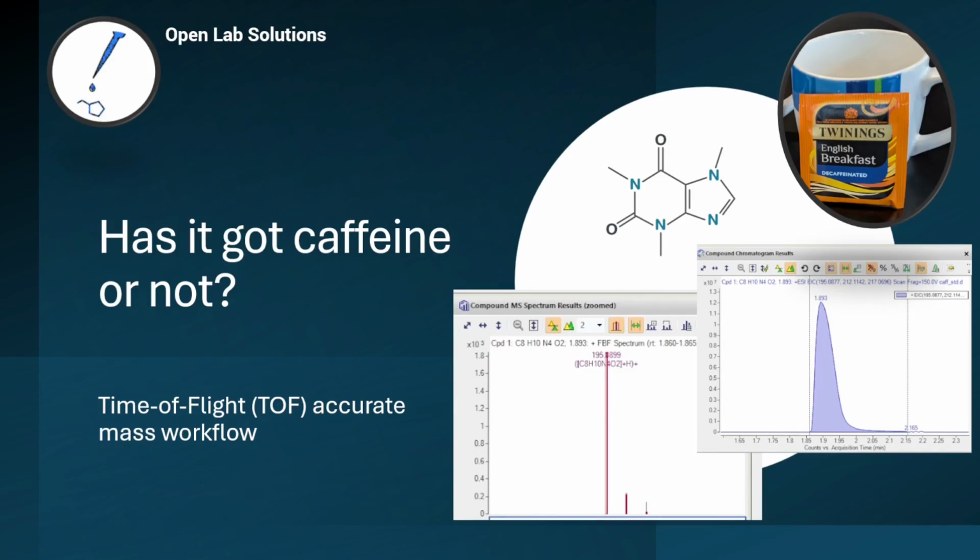Has it got caffeine or not? This is really to delve into some of those decaffeinated brands of tea out there and to see how much caffeine there is in them. We're going to do this in a relative comparison to some other teas. This ties into a video I previously created on how we analyze the caffeine molecule using mass spec, specifically using time of flight in an accurate mass workflow.